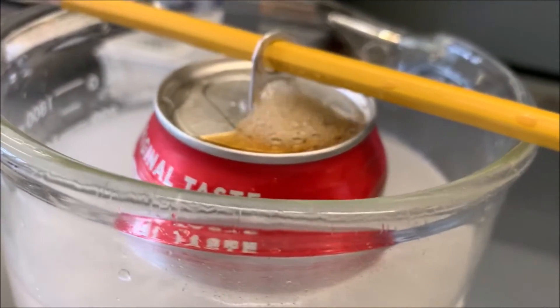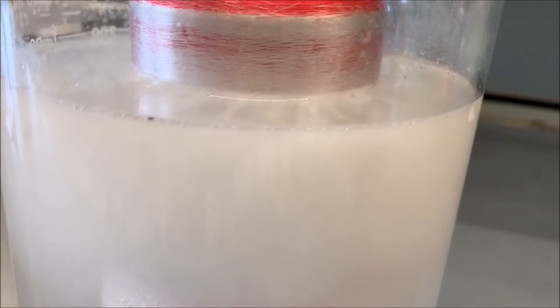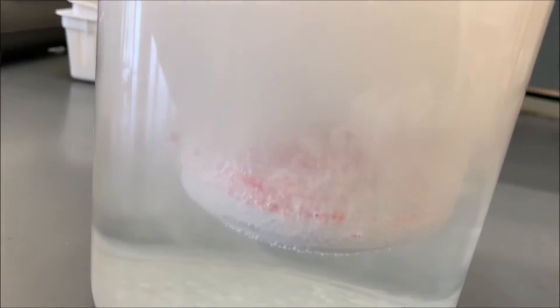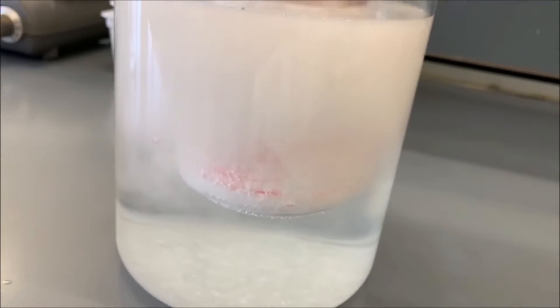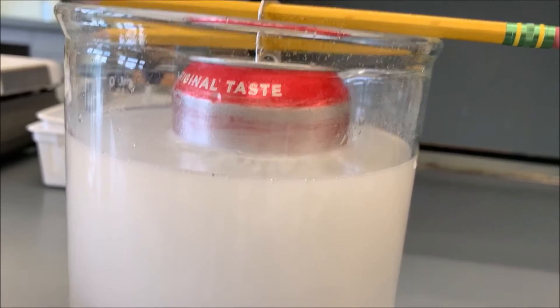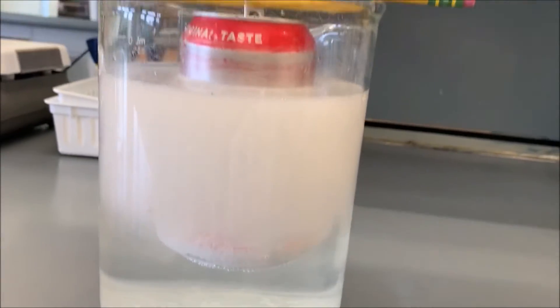It's causing the carbonation to come out of the soda. And you can see bubbles of gas being produced around the perimeter of the aluminum can — that's bubbles of hydrogen gas. We'll add a little bit more water just to make sure that we get all of that can dissolved.